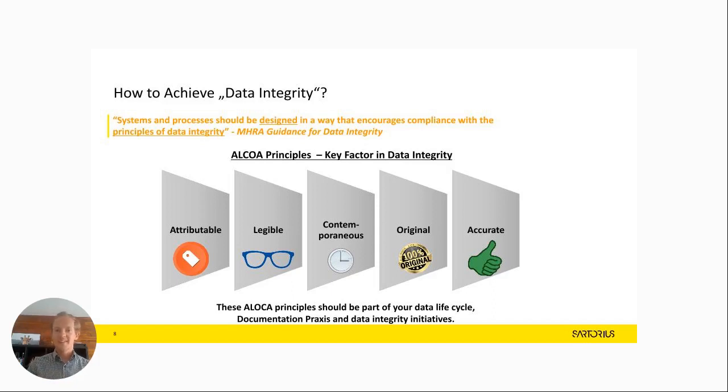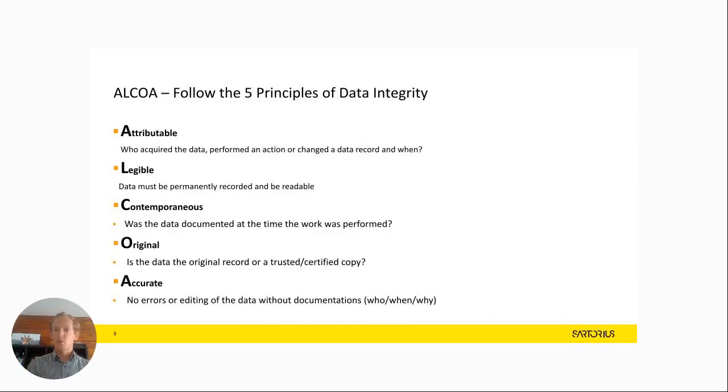Let's transfer this into a lab application. What does that mean? Attributable. Who acquired the data? Who did the work? Who performed the action? Or who changed something? If we do an internal calibration on an instrument, or if we create a user, all of this has to be recorded, as well as the changes in setup.